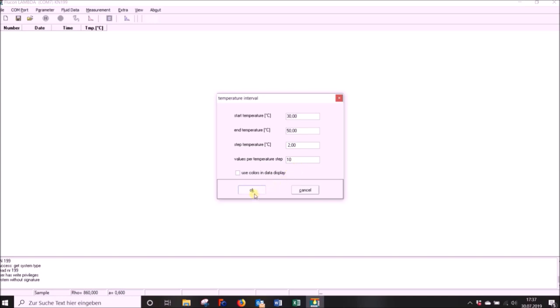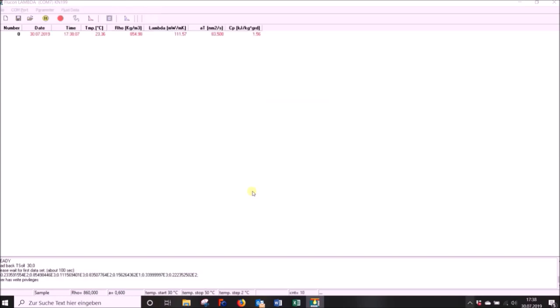Eventually, click on OK to start the measurement. The remote control of the thermostat will now be activated and you will find the first row of your protocol displayed in red until the sample reaches the start temperature of your choice.